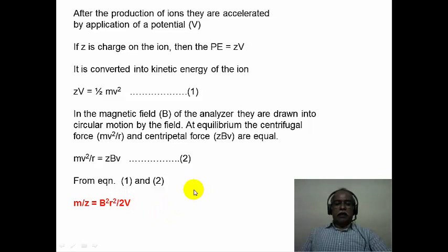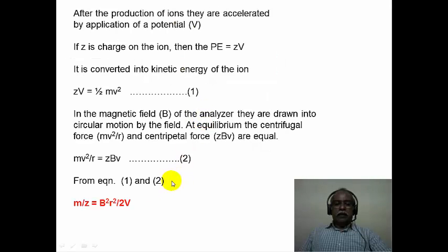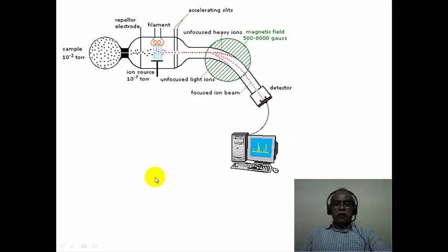So essentially, in a mass spectrometer, there is no one weighing the masses using a balance. In fact, the masses are segregated by the application of a suitable magnetic field and acceleration voltage. By tuning the acceleration voltage and the magnetic field strength, one can bring a specific ion into the curvature R, which matches the spectrometer curvature. Only those ions which match the spectrometer curvature will go through this passage and reach the detector.